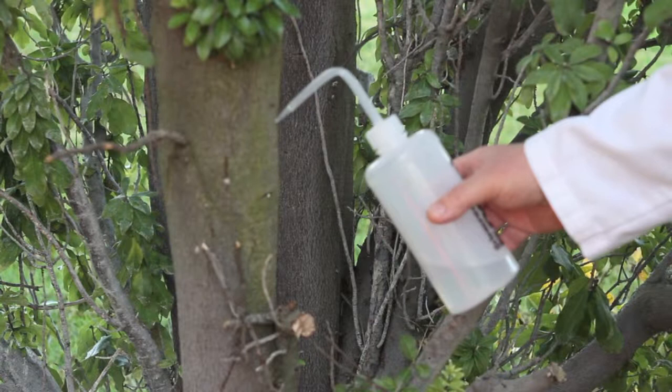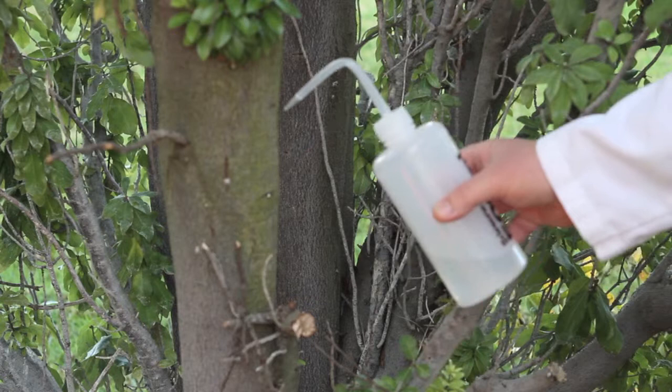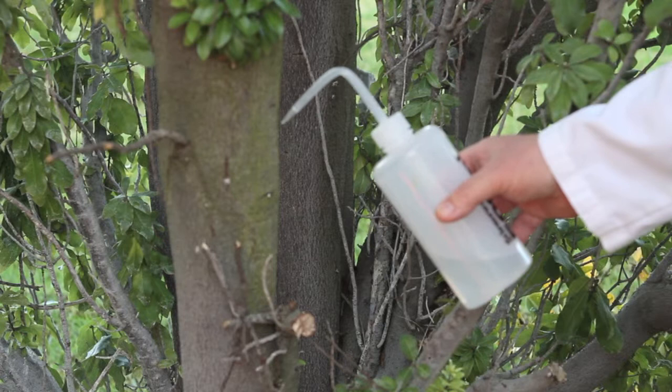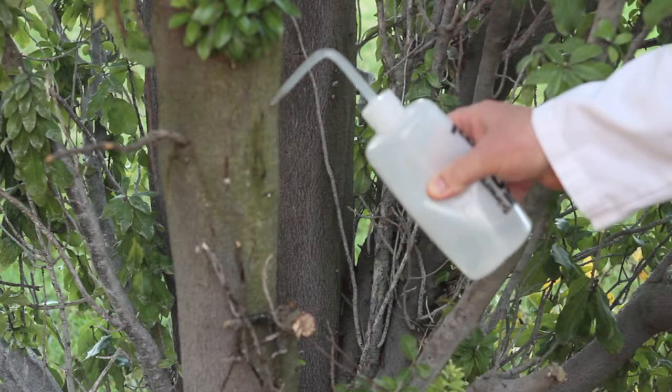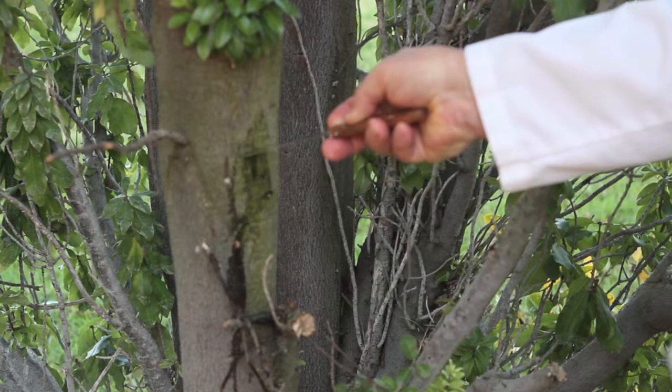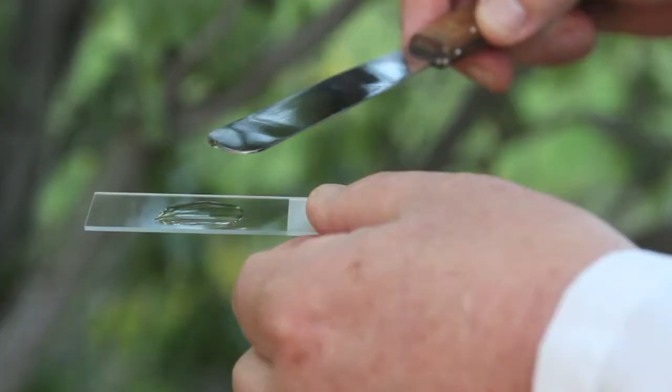Now I want to show you something else that's really cool about microbes. Some of them grow on the sides of trees, and you can scrape them off with a spatula and put them on a slide and look at them under the microscope. Here on the trunk of this tree you see this green patina or coloring — those are microbes, probably algae, blue-green algae, and maybe diatoms growing on the side of a tree. You can find this in your own backyard if you live in a temperate zone. I'm just going to wet this down a little bit to help grab the cells, then reach in with a spatula and very gently scrape up along the side of the tree. Now I have a specimen that I'm going to put on a slide and look at under the microscope.